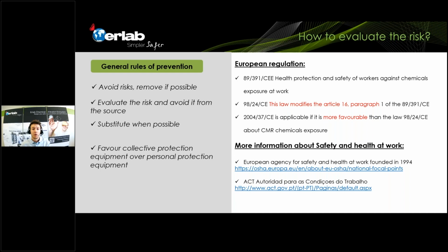And then you can always look for good solutions, technical but also organizational. You can look for different solutions which will minimize the risk again. So you need to favor collective protection instead of personal protection. A really good example is that we are all confronted with the coronavirus. A collective protection that we're all doing today is that we wear masks when we go onto the street.